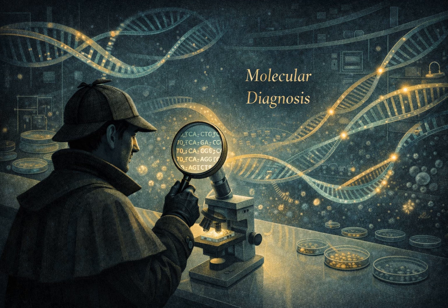Step 1 is denaturation. You take your sample, which has the DNA in it, and you heat it up to about 95 degrees Celsius. Nearly boiling. Pretty much. This intense heat is enough to break the weak hydrogen bonds that hold the DNA double helix together. The two strands of the ladder just unzip. They separate, creating two single strands. Step 2.